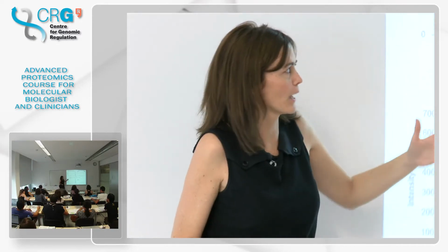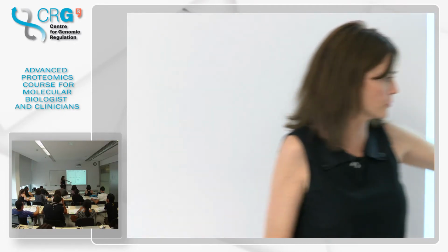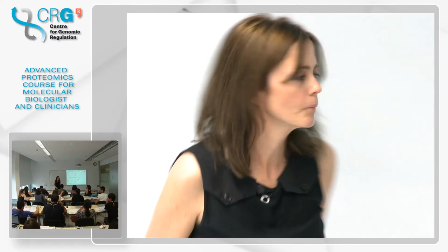Okay. So you can visualize it in different ways, and you will do that. Here, we ask the software, show me this peptide. And here, we ask the software, show me this peptide. Simply. Just that. When you also have a little interference in your heavy, you can also have that? It's possible. This is real data.